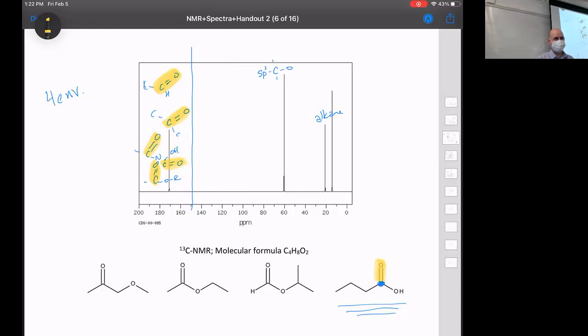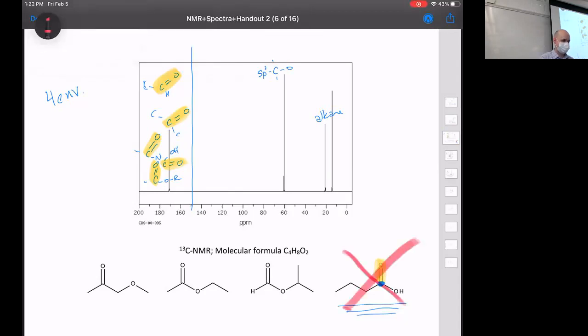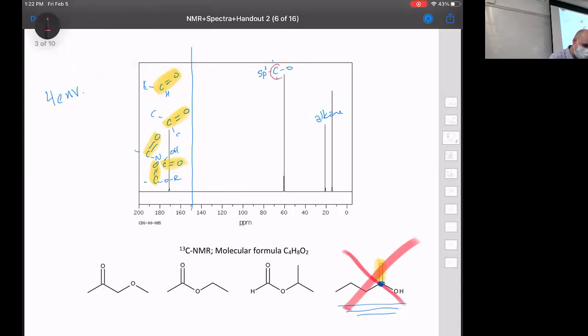So you're saying it's, oh, okay, right. So we need another oxygen in the chain there. Yes, so this carbon right here, and whatever this carbon is, we don't know about this carbon, and the carbonyl are different carbons because they have different peaks.